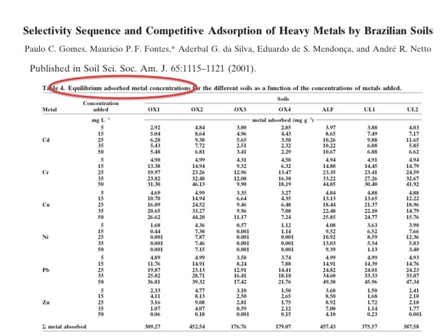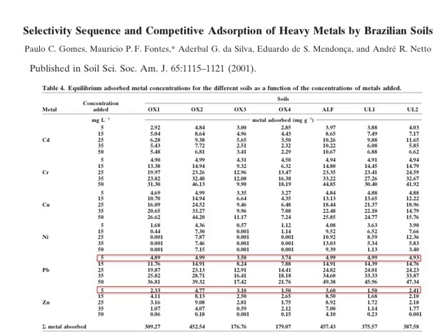The data in Table 4 is very similar to what you have collected. For different cations added in different concentrations, you can see the amount that was retained by the soil. The values are reported in ppm. These indicated values show the amount of lead or zinc that was retained when 5 ppm was added to the different soil samples.